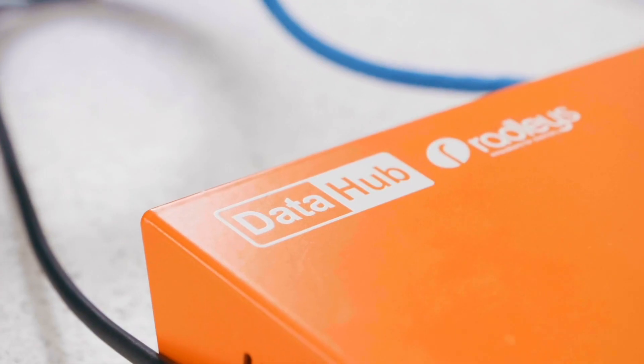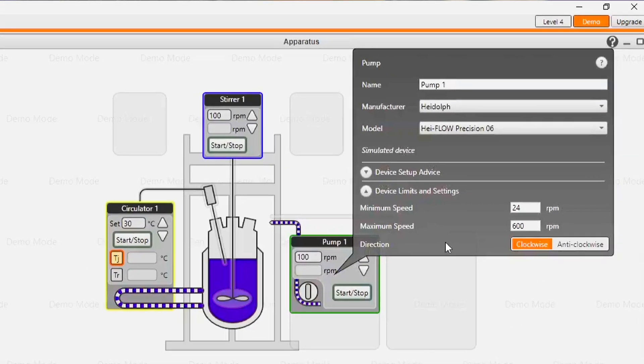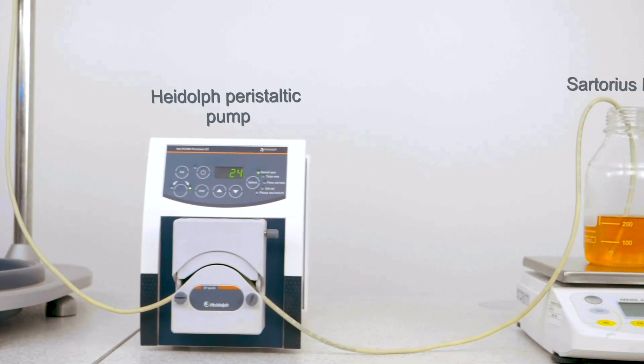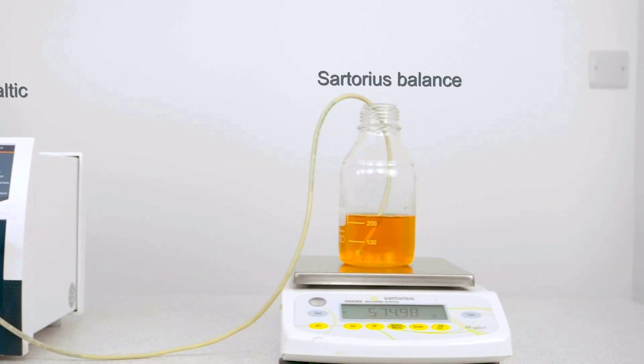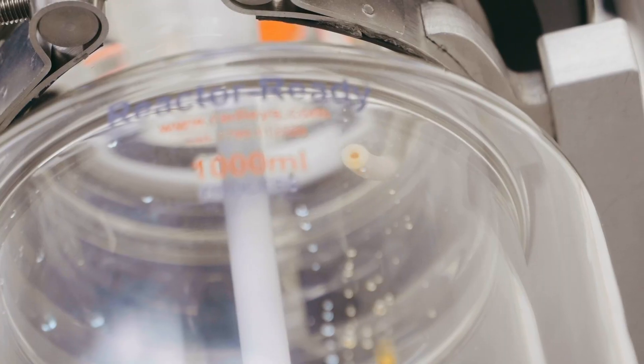AVA is not restricted to Radleys devices, so we can also control third-party devices such as pumps for liquid additions. A key benefit here is letting you run long reactions outside normal working hours or reduce the amount of night shift work for your team.